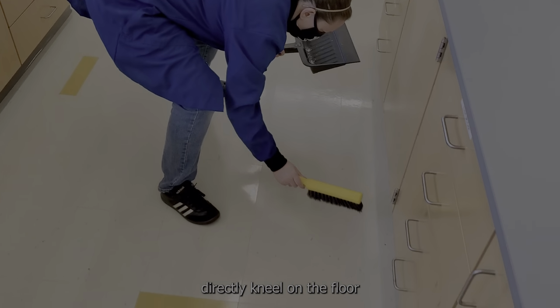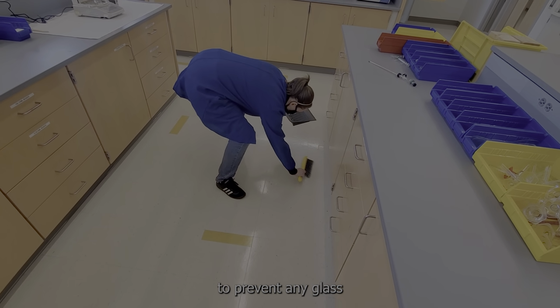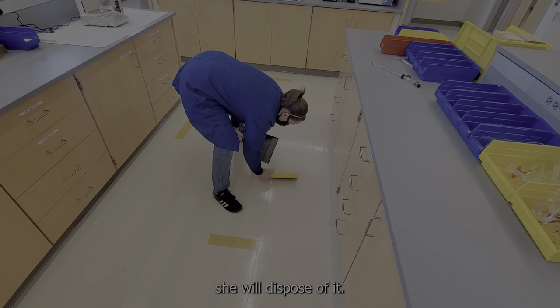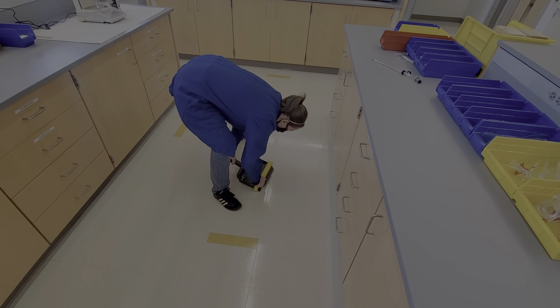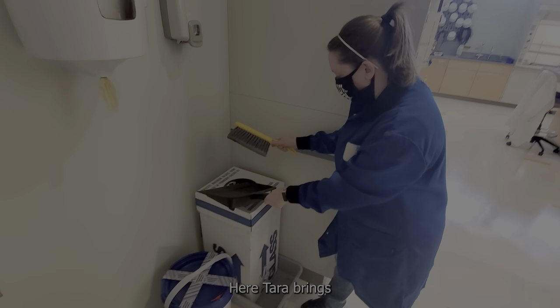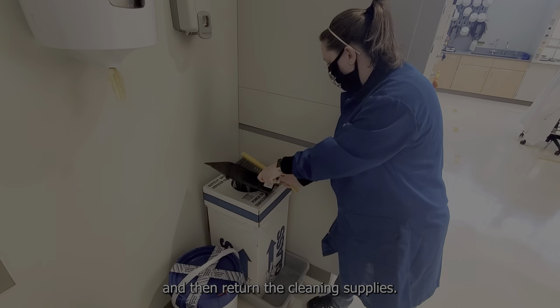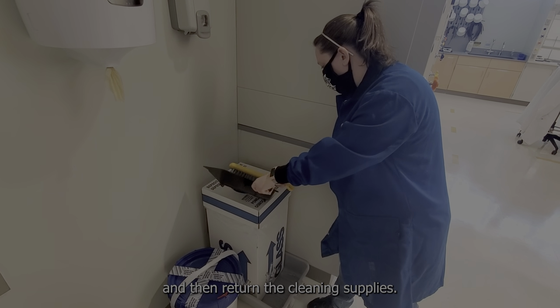Notice she does not directly kneel on the floor to prevent any glass from cutting into her clothes. Once she cleans up the mess, she will dispose of it. Here, Tara brings it to the glass waste disposal, where she will empty it out and then return the cleaning supplies.